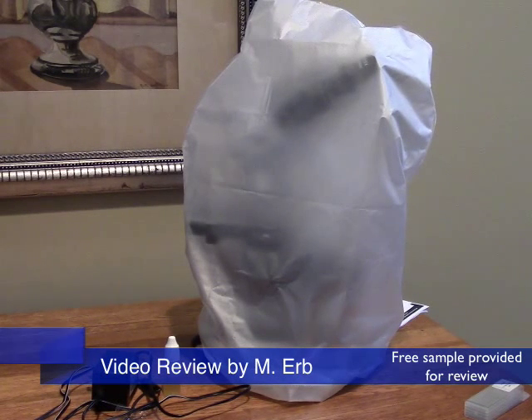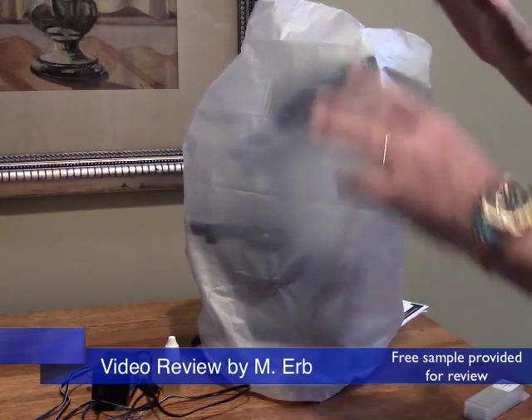Hi, this is Michael and this is my review of the Omano OM36 Binocular Compound Microscope. This is it right here.